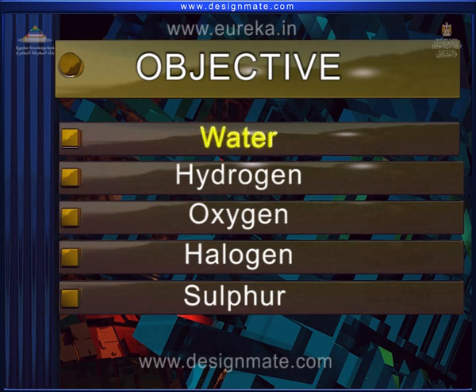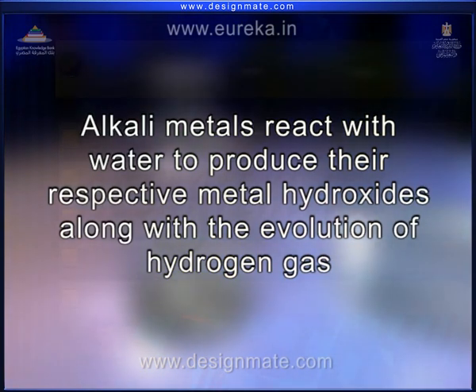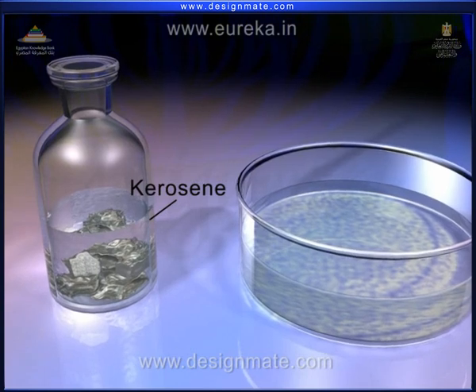Reaction of alkali metals with water. Alkali metals react with water to produce their respective metal hydroxides, along with the evolution of hydrogen gas. Let us see the reaction of potassium with water.